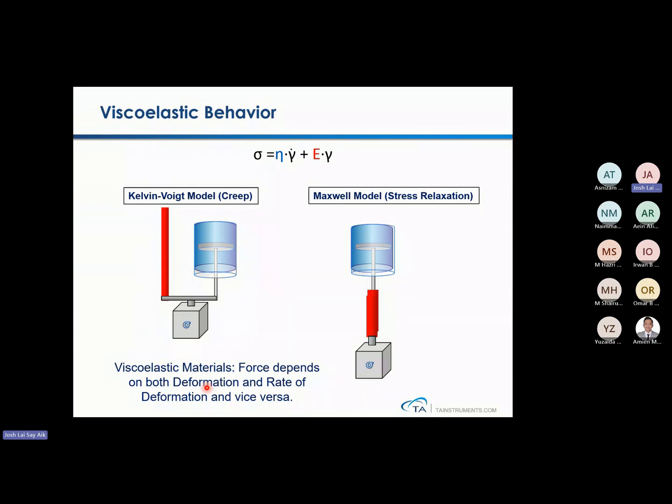Coming back to your question just now, you asked me about tensile machines and instruments that do flexing, tensing, or compressions. Is it similar to what a rheometer does, right? Yeah, they are different.